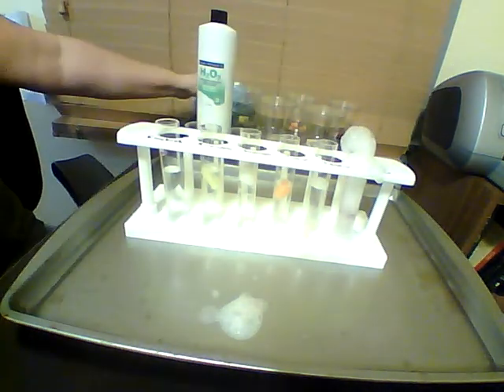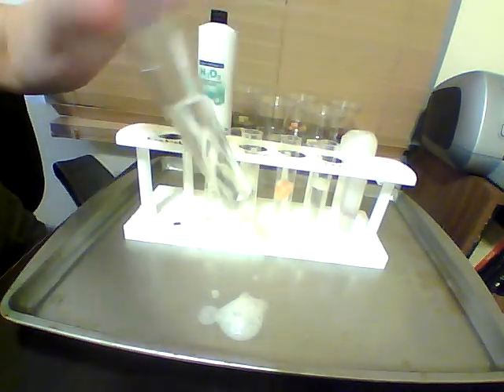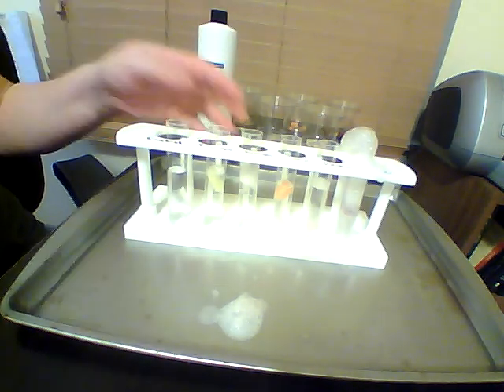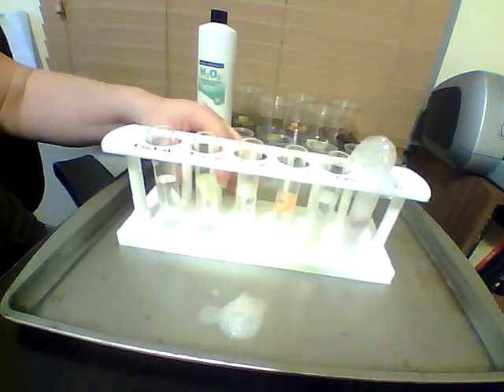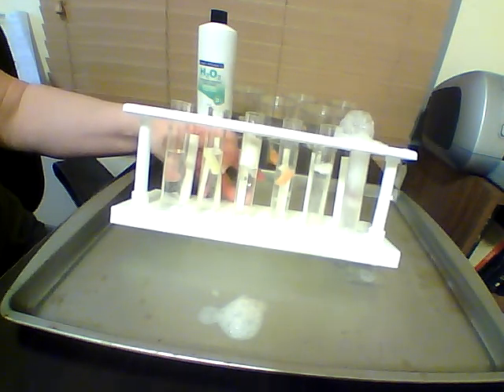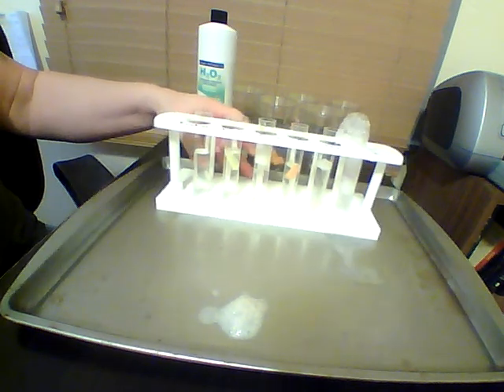All right, so again, we're going to compare that to our control, which has very little reaction to it. Okay, so these are all examples of raw materials that are in there. Hopefully you can see the labels on here. You guys can see that the banana reacted a lot, the potato quite a bit, the pineapple, carrot probably the least, and the liver is by far the strongest reaction.